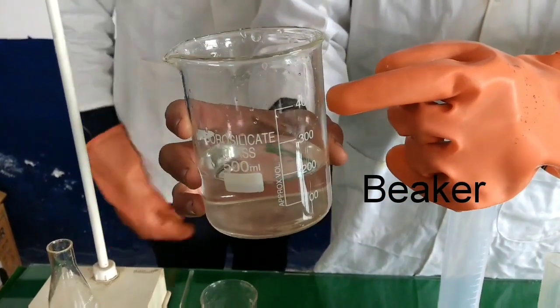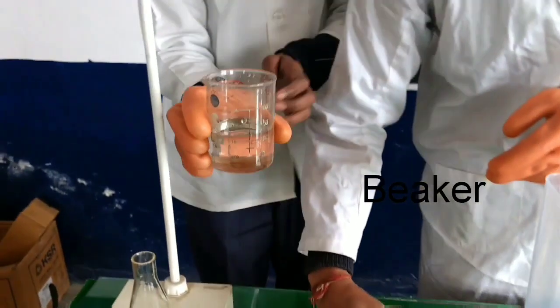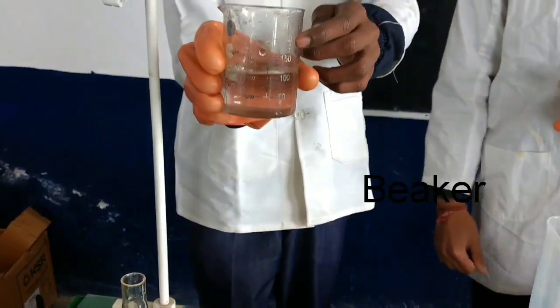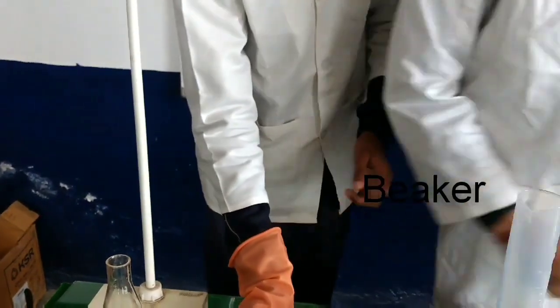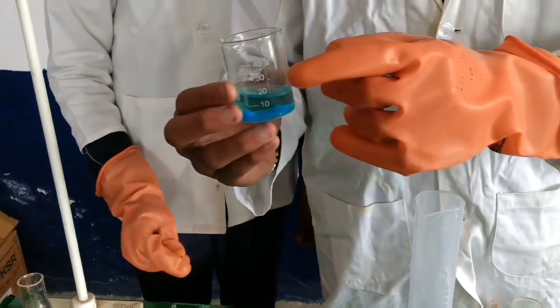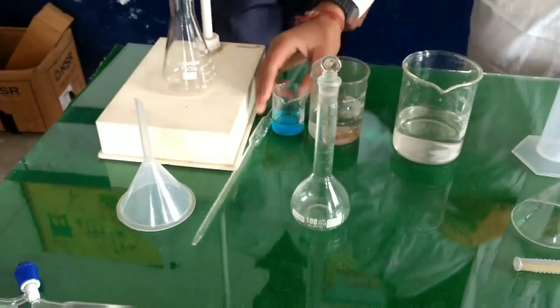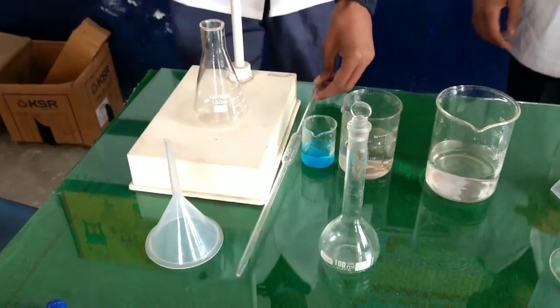Then, if you want to keep any liquid, then this is a beaker. Again, beakers are of different capacities, 1 liter, 500 ml, 200 ml, 50 ml, having the mark on their wall.